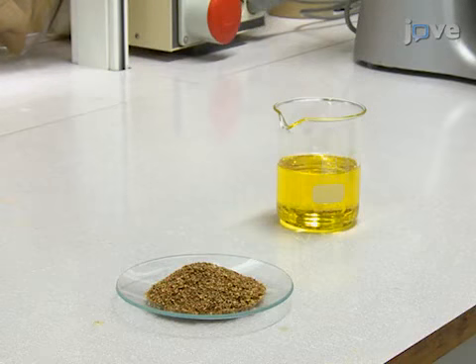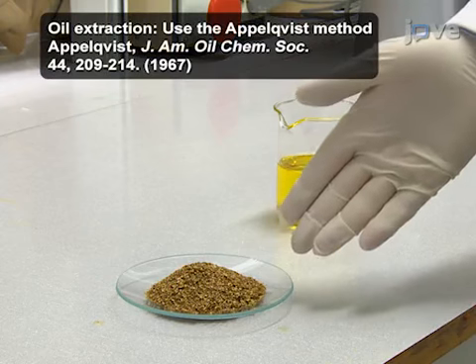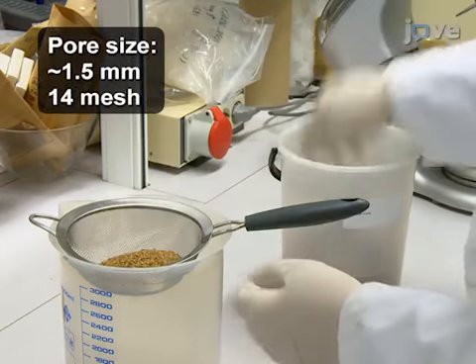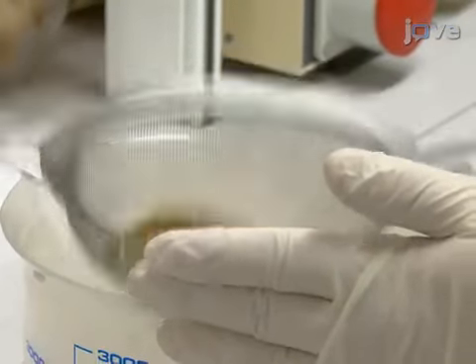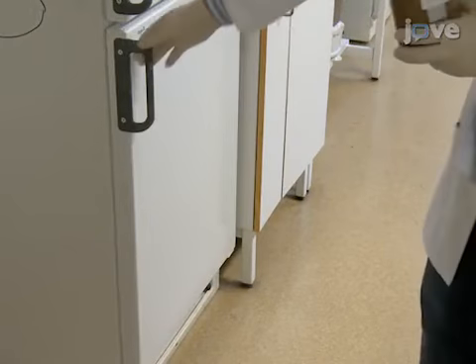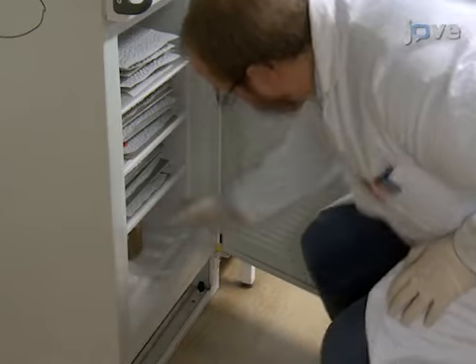To begin, obtain Crambe seeds, extract the oil, and save the resultant Crambe meal. Next, sieve the Crambe meal with a round fine mesh stainless steel kitchen sieve to remove the large fiber fractions and uncrushed seeds. Store the sieved meal at -18 degrees Celsius to prevent the material from aging.